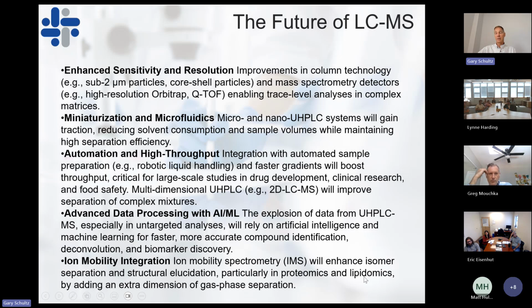The lipids can be 10,000 or so lipids within any given sample, and by combining ion mobility with LC-MS, we're able to provide an enhanced separation of lipids through this extra dimension of gas phase separation.